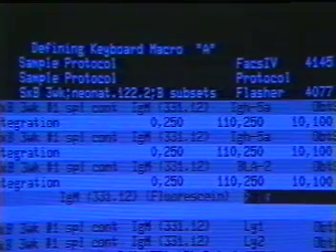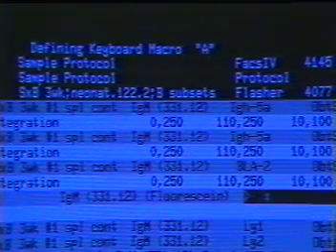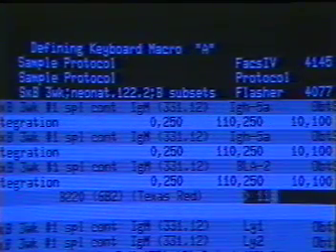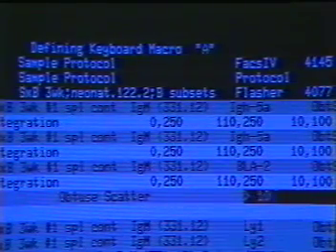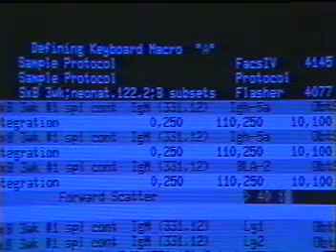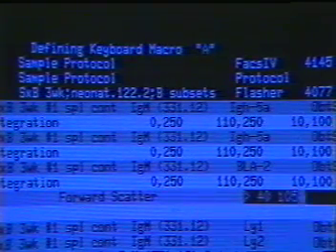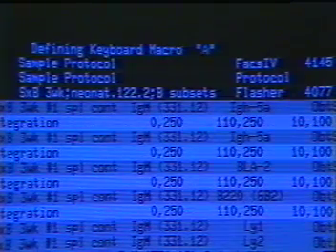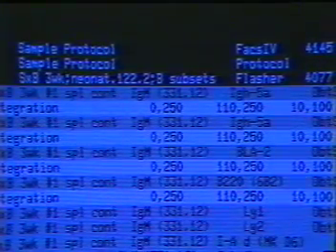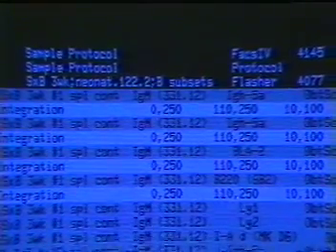We type Insert, then, after entering each set of gates, we press Return. Every keystroke given while defining a macro command will be recorded in the order it is given. When the analysis request is complete, we close the macro by pressing Enter 3 times in a row. This causes the Defining Macro A message to disappear, thus indicating that the macro is complete.